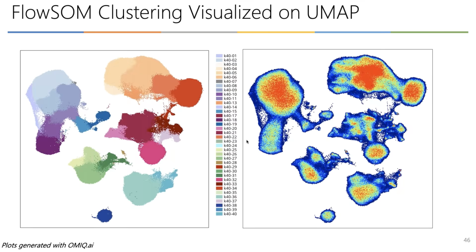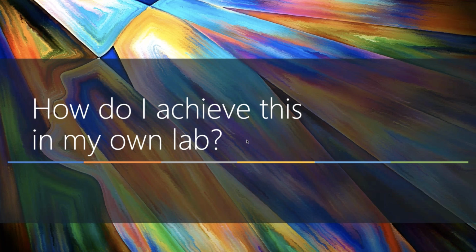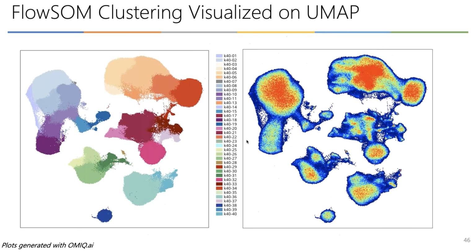Now, am I going to ask you to always look at this data in 2x2 plots? Absolutely not. We have very strong collaborations going on with different third-party softwares: FCS Express, OMIQ, Astrolabe. We're very grateful for all the work that they're doing to help us understand the data and to help us visualize the data.